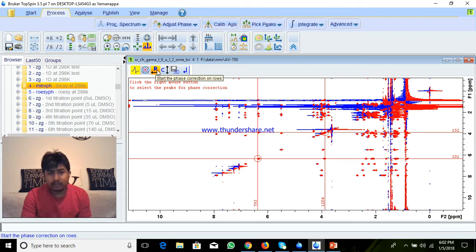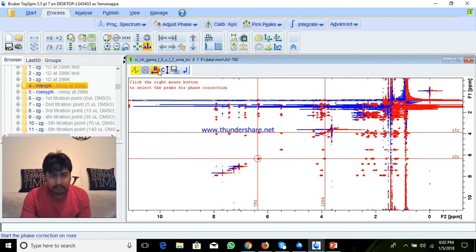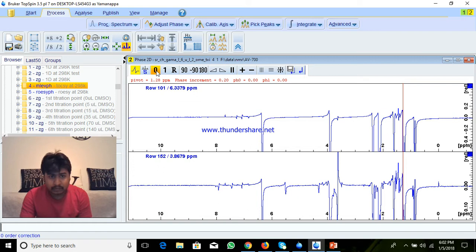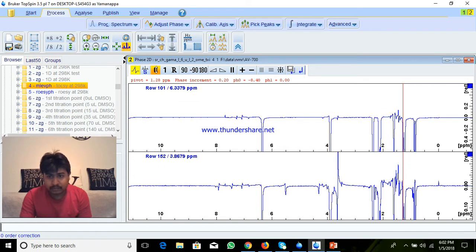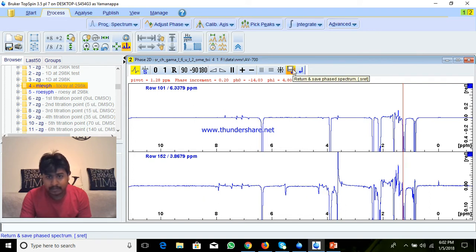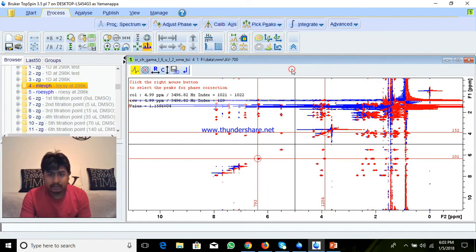You can do the phase correction on rows or you can do phase correction on columns. You select column — actually this is fine, you only select rows. What I will do is I will do the 0th order phase correction and 1st order phase correction. Then this one is save and go back, and this one is without saving you can return. I will do save and go back.